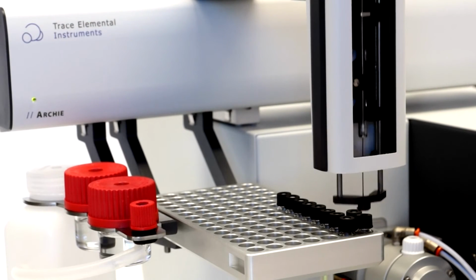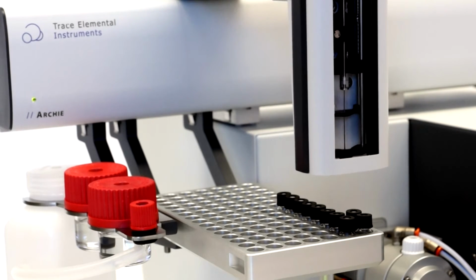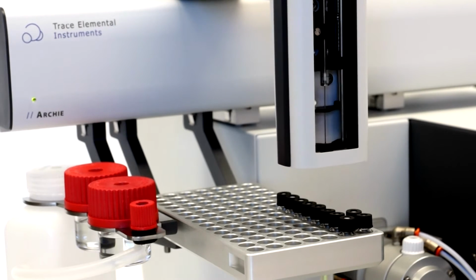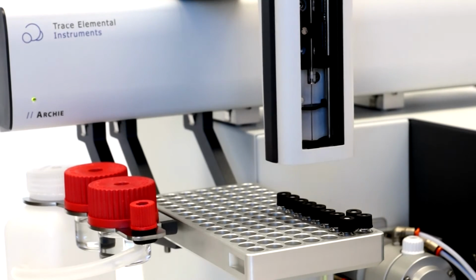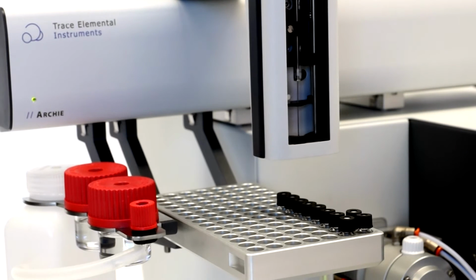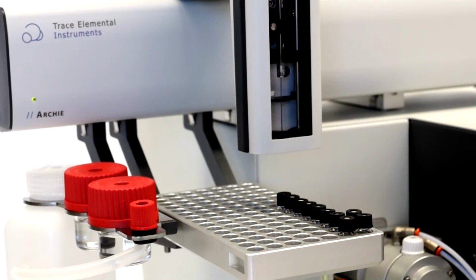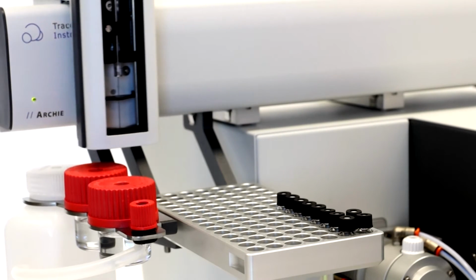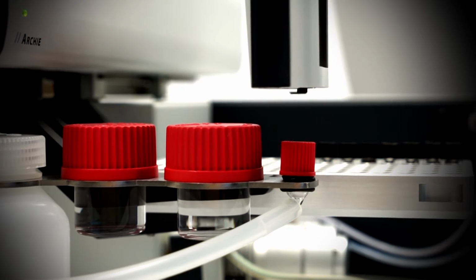The Archie will first check if all vials are present. After checking if all the vials are present, the Archie will clean the syringe before creating the dilutions.